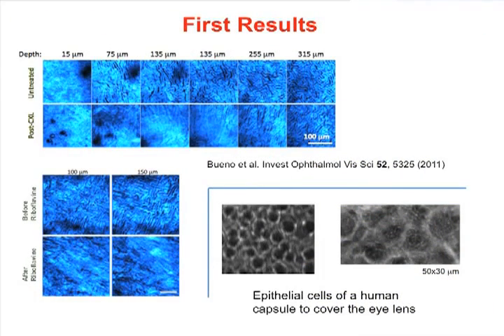We have previously obtained results in multiphoton microscopy in the cornea, in collaboration with the University of Murcia, to investigate changes in the corneal stroma after cross-linking treatment in bovine and porcine eyes. The second harmonic generation images show changes in the anterior corneal stroma, like the turn of the regular collagen patterns into randomly distributed structures, and this might be a consequence of the corneal thickness decrease as a result of the riboflavin instillation.